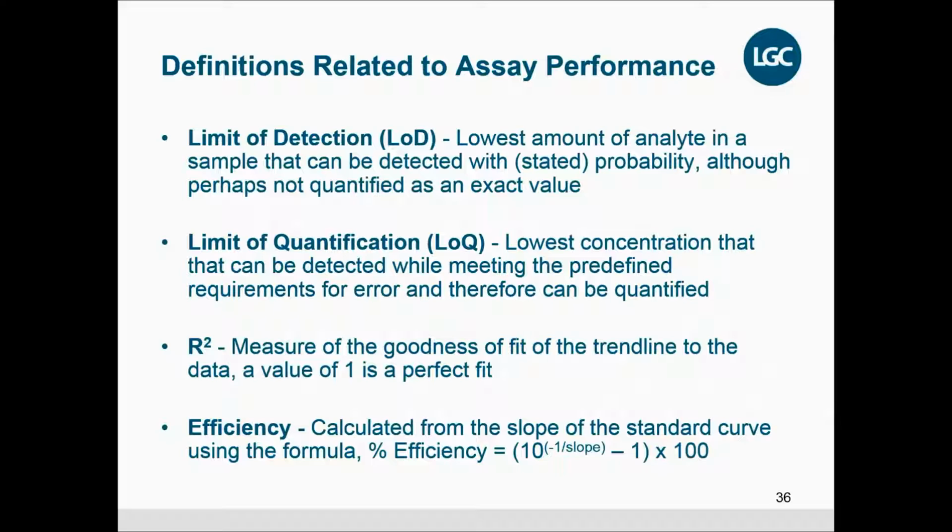So we took our synthetic DNA, in this case, and did a dilution series from 10 to the 7 down to less than a copy per reaction, and used 8 replicates per dilution. The more replicates you have, the more precise or accurate an answer you get when it comes to your efficiencies and your limits of detection and so on. For our assays, we use a standard 200 nanomolar probe concentration and 600 nanomolar primer concentration. These can vary depending on the assay or the instrument you're using, but there are standard ranges which are appropriate.